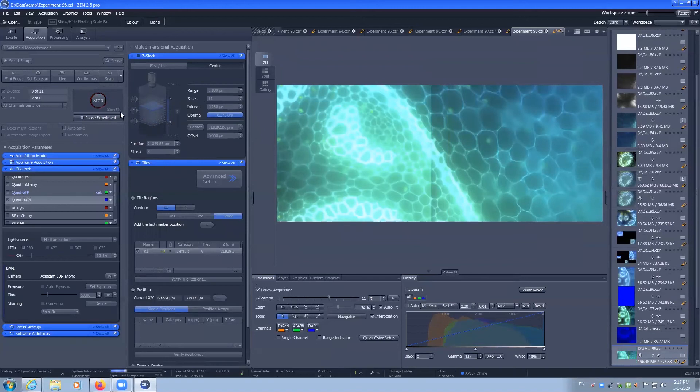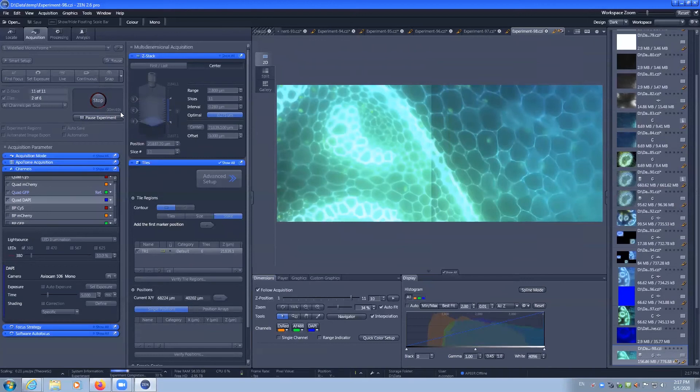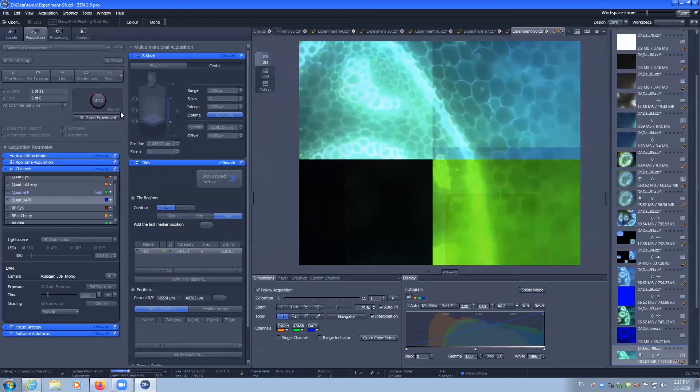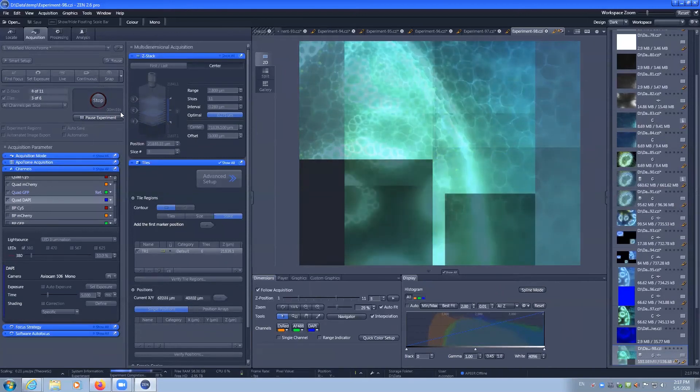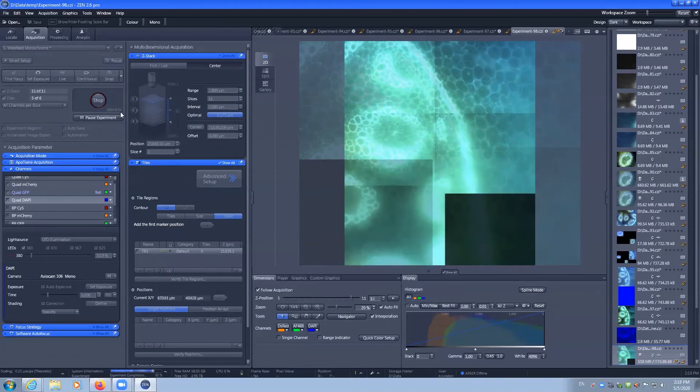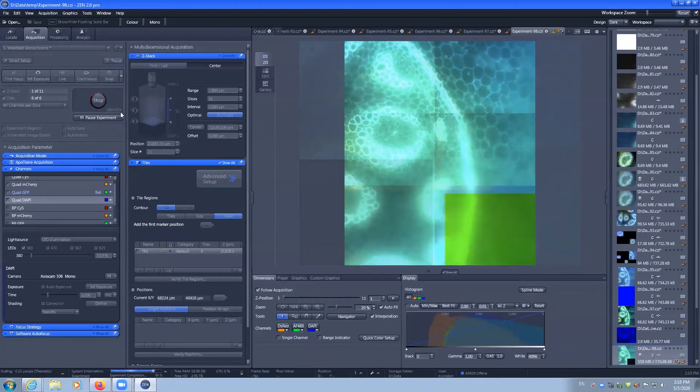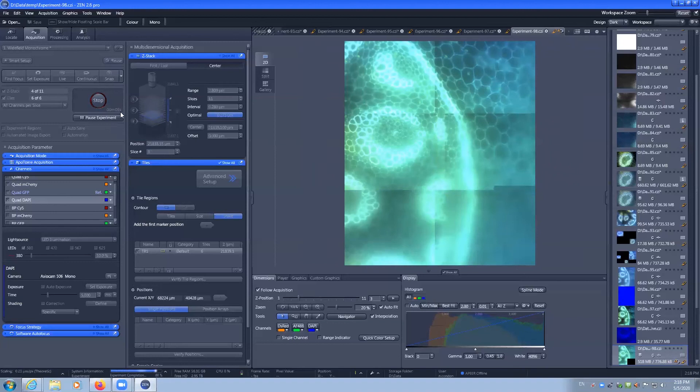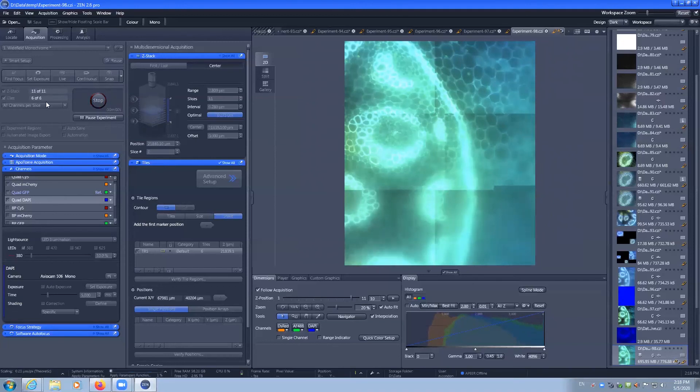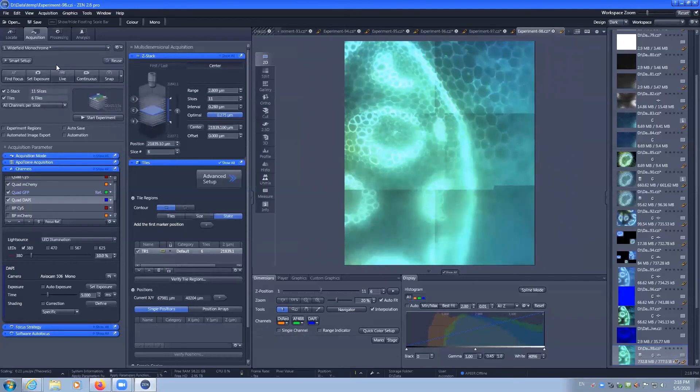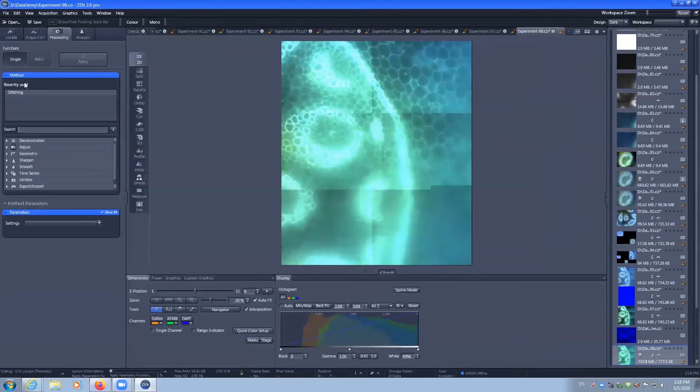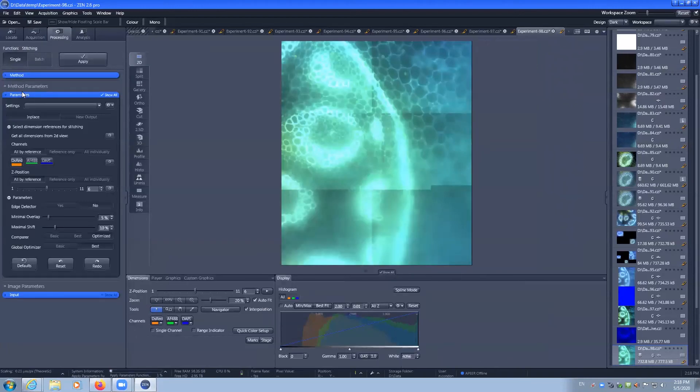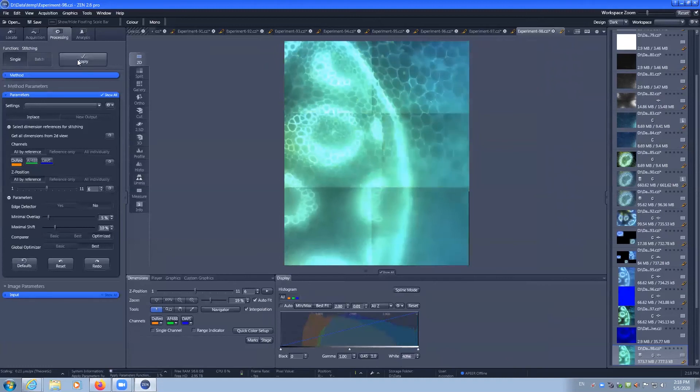Once the images are captured, we can then go and stitch them in the software. As you can see, as it's completed, now we can go to processing, methods, stitching, and we can apply that.